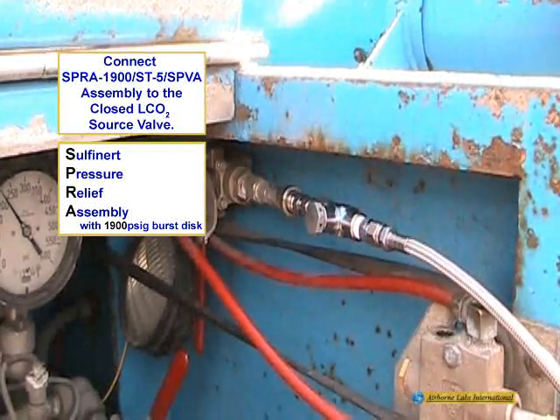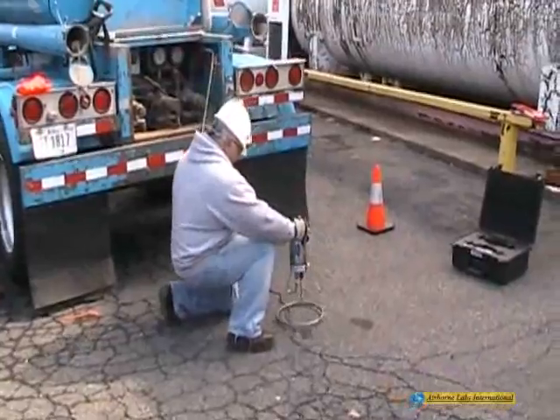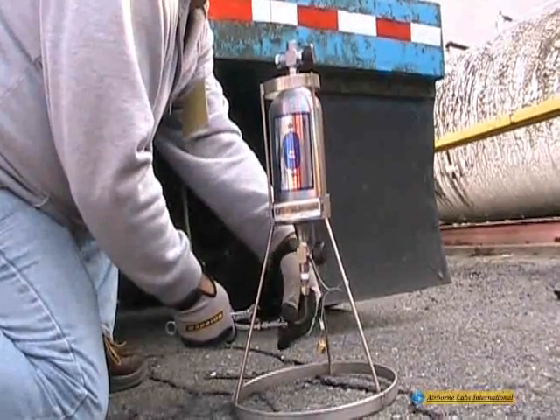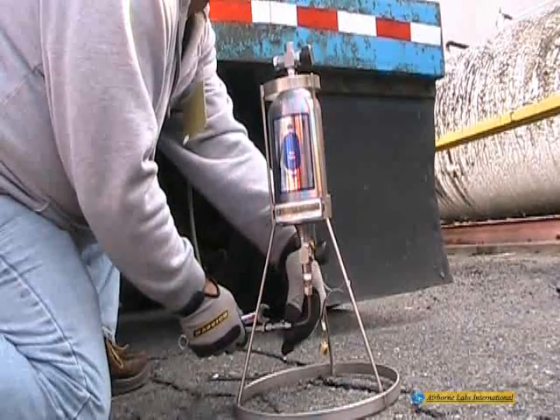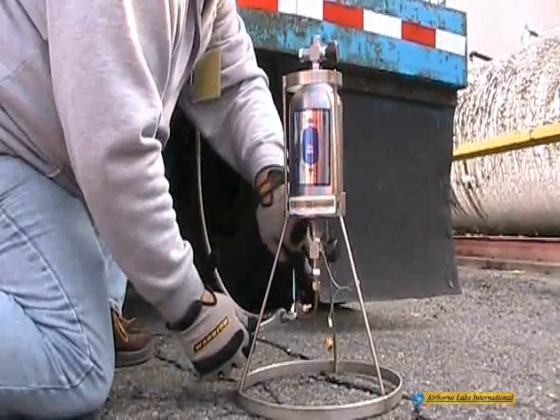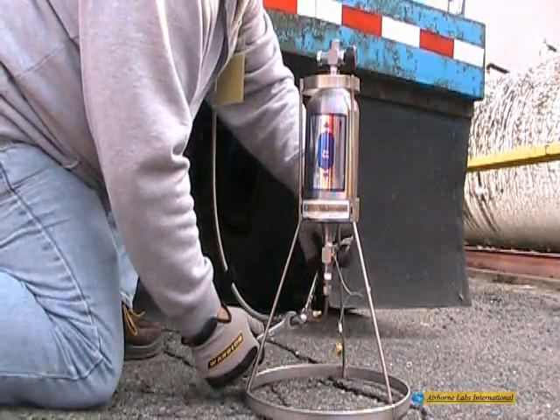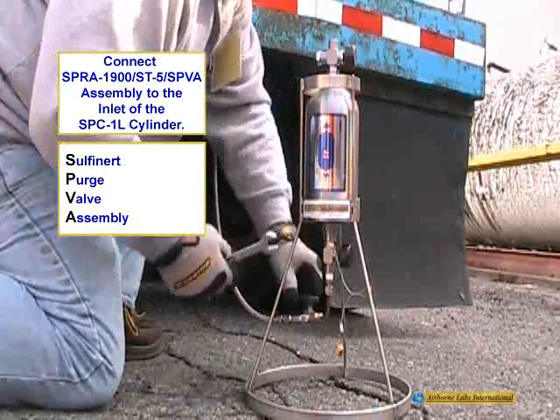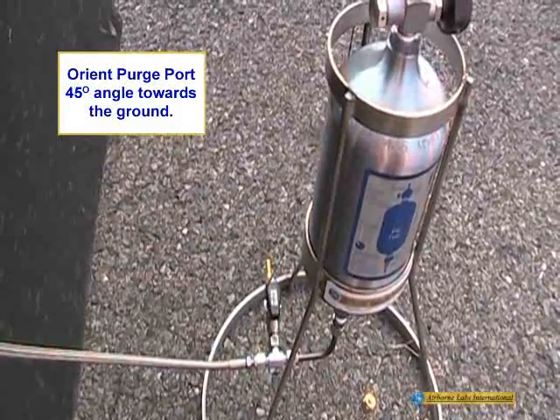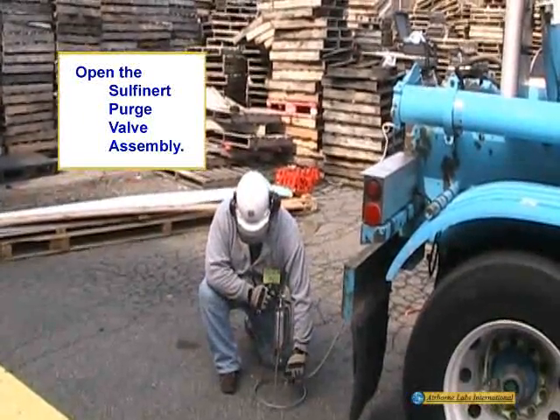Securely attach the SPRA-1900 ST5 SPVA transfer line assembly to both a closed liquid CO2 sample source valve and to the 1-liter cylinder via the inlet valve elbow fitting. Ensure the purge port valve is pointed away from you and all other equipment. It is recommended to orient the purge port outlet at about a 45-degree angle towards the ground.